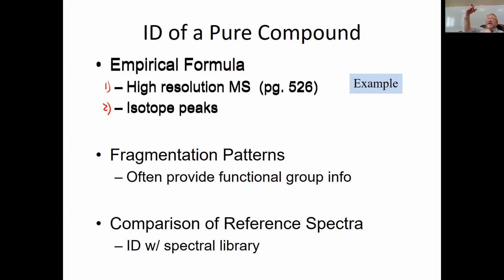Like if the quality of match is 100, then it's a perfect match. But it's never a perfect match, and you have lots of compounds that have pretty much the same match. So sometimes it's not conclusive. That's why we have other tests. So probably if we weren't using GC mass spec, if we're looking directly at just mass spectrometry that way, it'd work a little better.